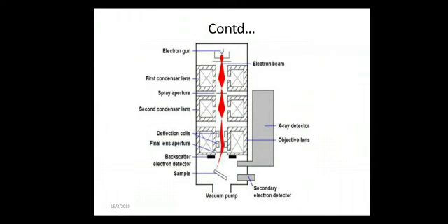Please try to understand: for optical microscopy, if you have a semi-skilled operator, that's more than enough. Whereas here we require a properly trained person to operate these scanning electron microscopes. Then only we'll get the clear image, and the process is faster. EDAX analysis can be done within 5 minutes, the data is generated in digital form, and minimal preparation is required to complete the process.